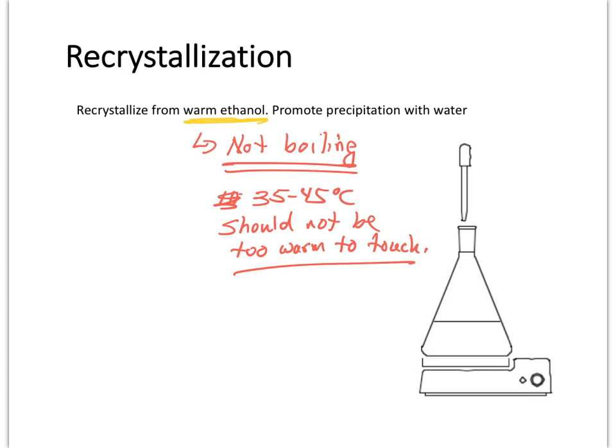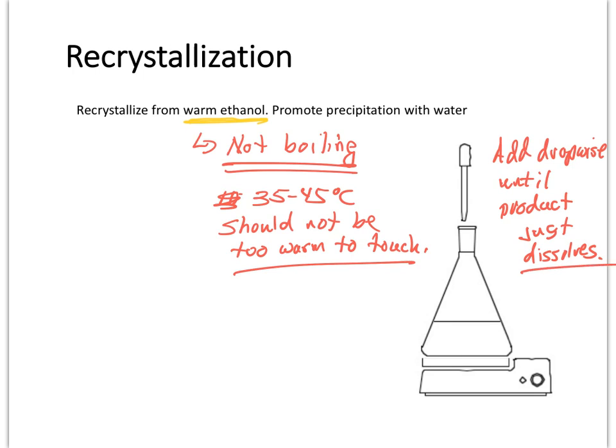You're going to add it dropwise until the product just dissolves. Okay? Again, keeping it warm.